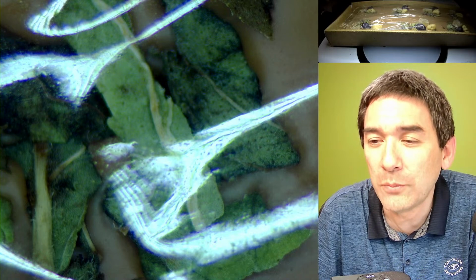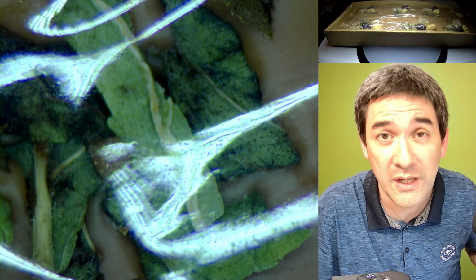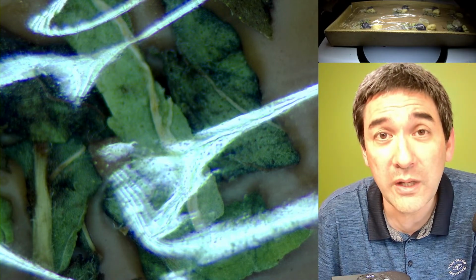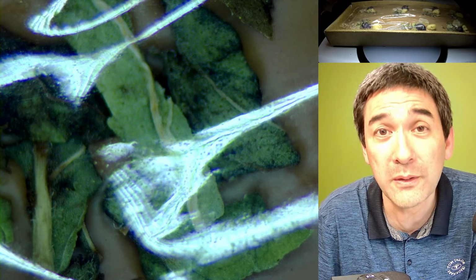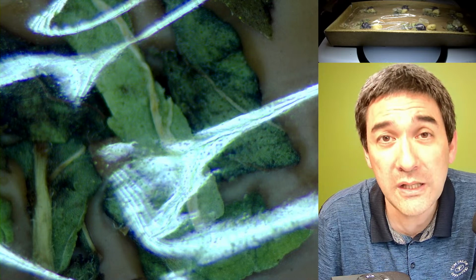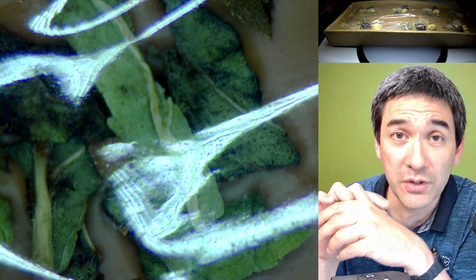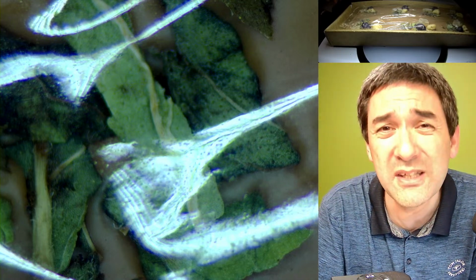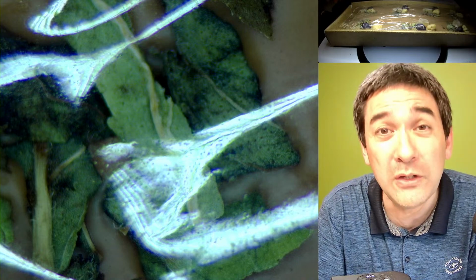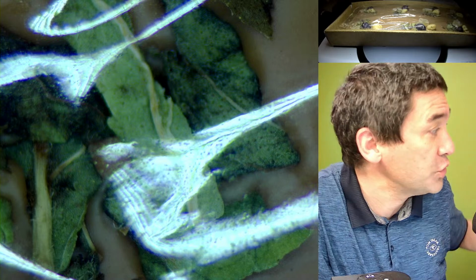Have you made a microtome technical video? I would like to watch a tutorial about it. Yes, I have done a few of those. If you want, I can show you some more. I'm using occasionally hand microtomes or table microtomes, but not those large sliding microtomes. If you want to make cross sections through soft tissue, the preparation time is quite extensive, and it also uses solvents that are not quite healthy. So I've not been doing that so much, but it is possible, and I can make cross sections through plants.